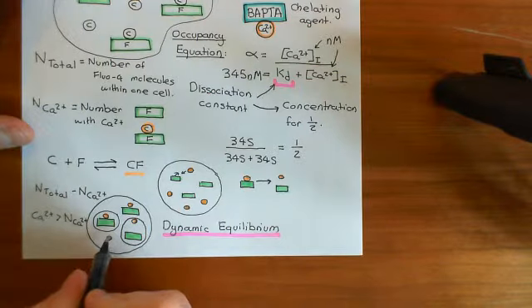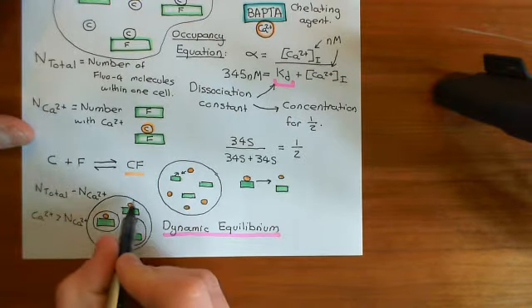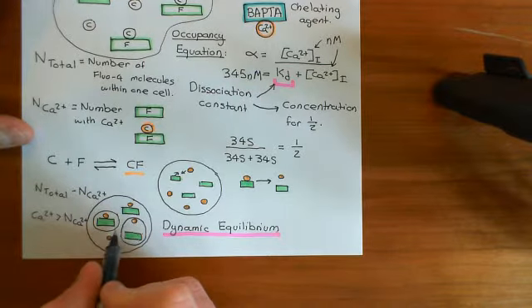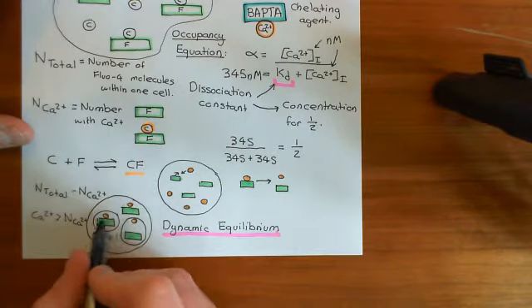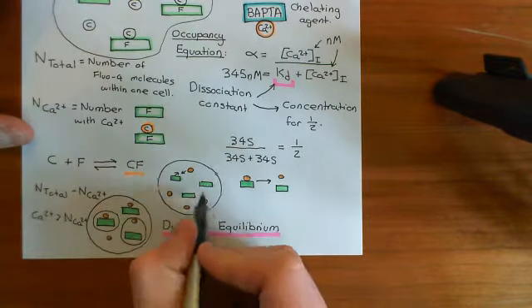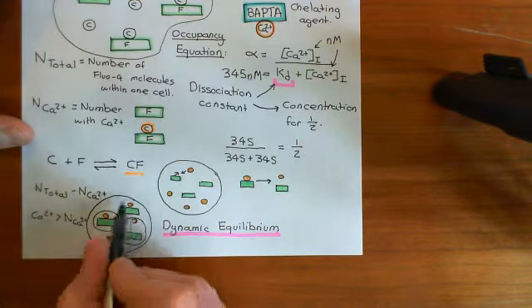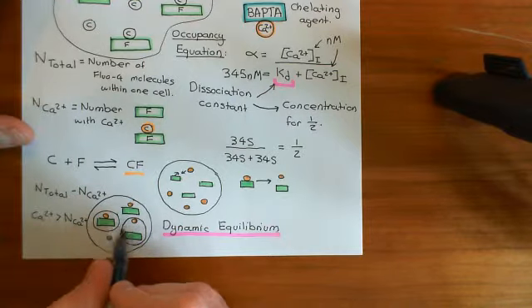So you assume, basically, that the calcium concentration in the cytoplasm does not change because calcium has bound to the Fluo-4 molecules. Okay, of course it actually does. The free calcium concentration does go down because the calcium ions are binding to the Fluo-4 molecules, but we're going to assume it doesn't. So what do I mean by that? Well, if we go back to this picture here, we started off with all the calcium ions free. Okay, once we've reached the dynamic equilibrium, some of the calcium ions will be bound to the Fluo-4 molecules.